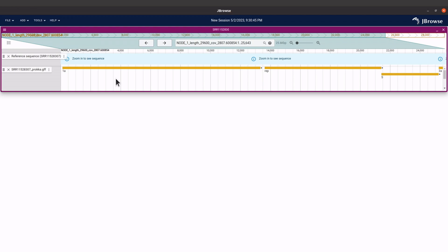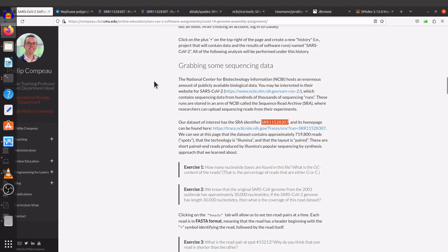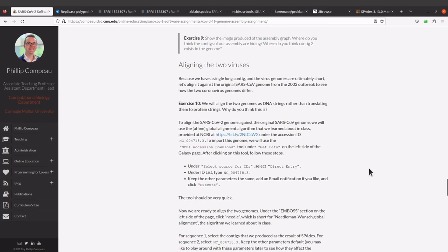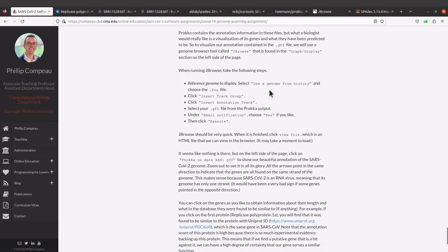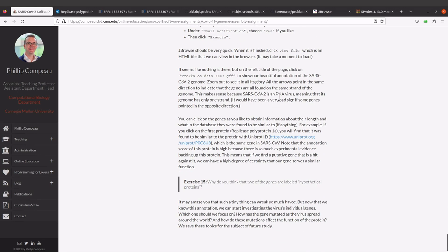Let's go back to the original tool — there are some statements there which I think you should also look at. Let's scroll down to the visualization part. When you are here, it makes this statement: it says all the arrows point in the same direction to indicate that the genes are all found on the same strand of the genome. This makes sense because we are dealing with SARS-CoV-2 data, and this is an RNA virus, meaning its genome sequence has only one strand. It also tells us it should have been a bad sign if some genes were pointing in the opposite direction.